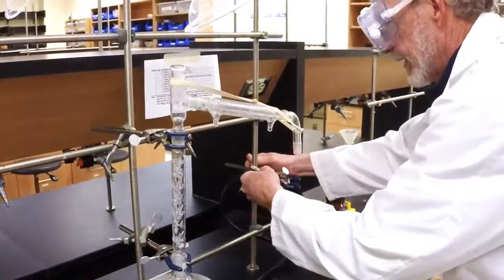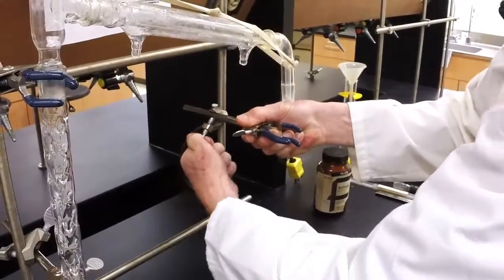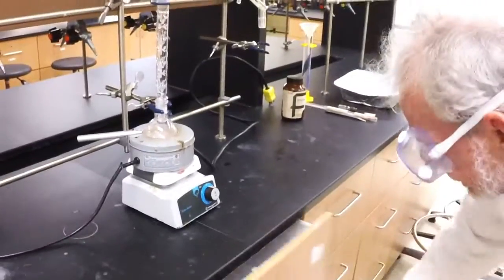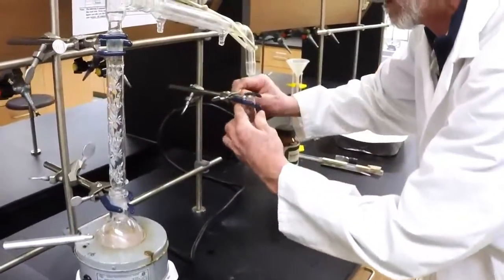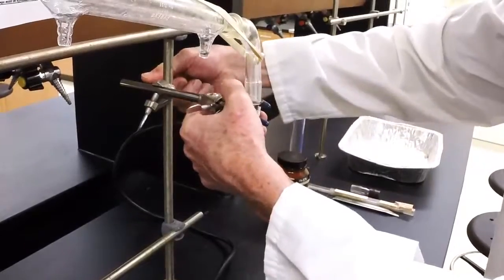Finally, we're going to have a receiver flask here. We're just going to use a 50 milliliter Erlenmeyer. Clamp that one in place and slide it up into position.